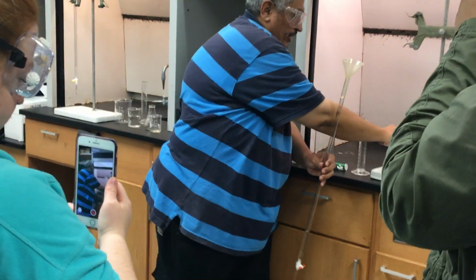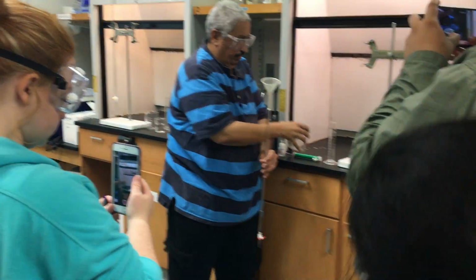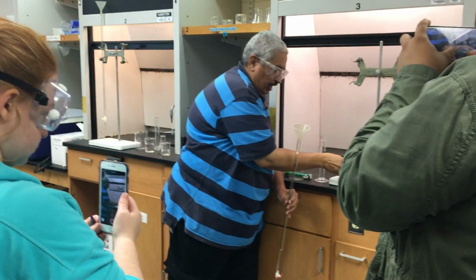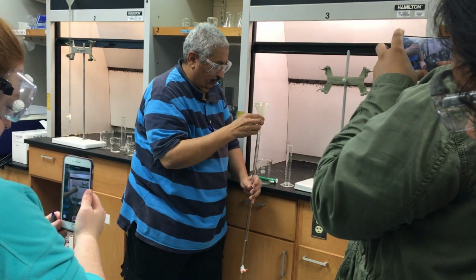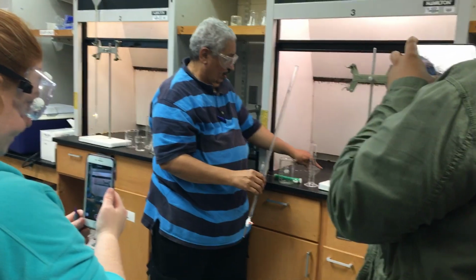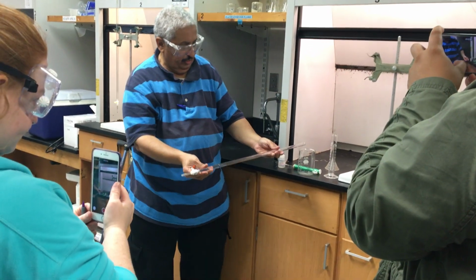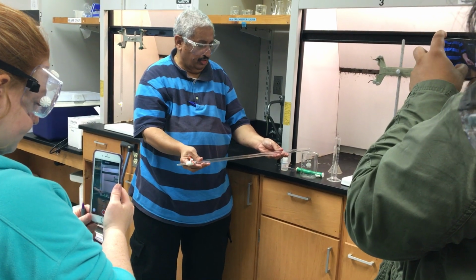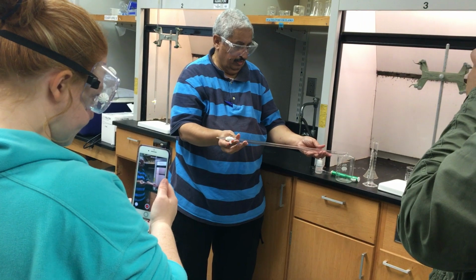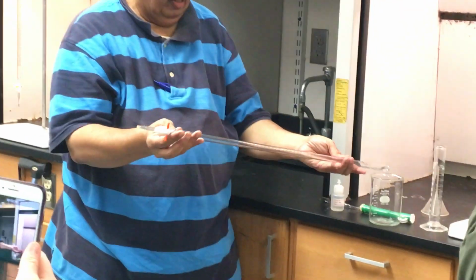If you look at this, here it is, guys. This is my waste beaker here all the time. Did I put it? I used this one here, correct? So let me see. I'll condition it now, trying to rotate the whole thing here. Look at this, conditioning with sodium hydroxide. Sodium hydroxide is coating the inner wall of the burette, so everything is covered.